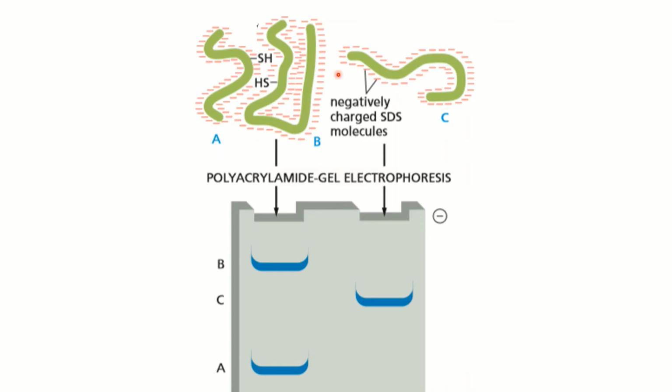And here we have a protein of medium length, and say we put it in this well, and then we run the electrophoresis. So notice here, after several tens of minutes, that proteins A and B have traveled through the gel at a different rate. Protein B is somewhere here on top, and protein A has traveled even farther here. And protein C is just somewhere here in the middle.